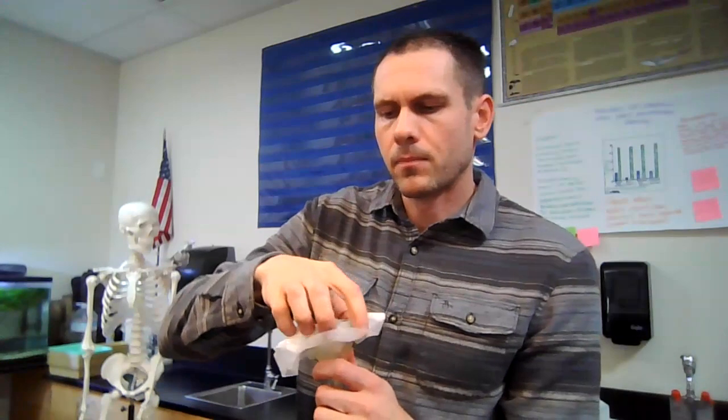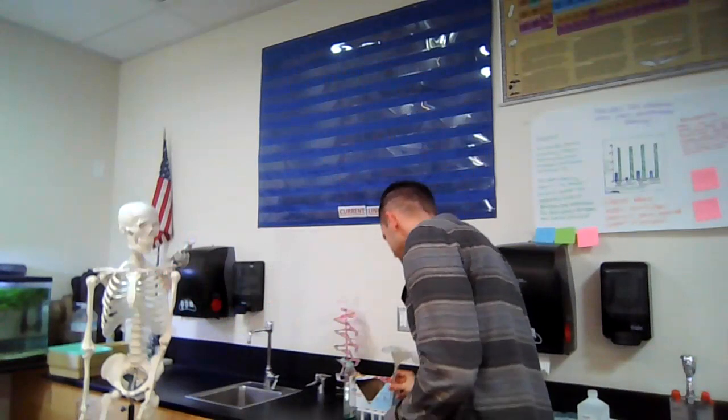I just get it a little bit moist, and I very carefully push it down into the funnel so it makes a little bowl. All right, so now I can pour all the strawberry stuff into there. The solids will get stuck on the cloth, but the liquids can seep through into the test tube. That's the whole idea.